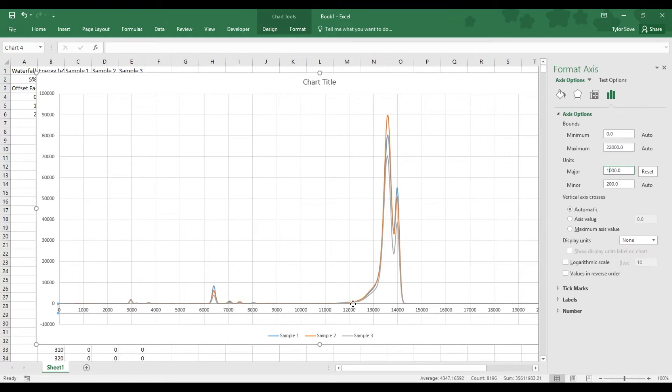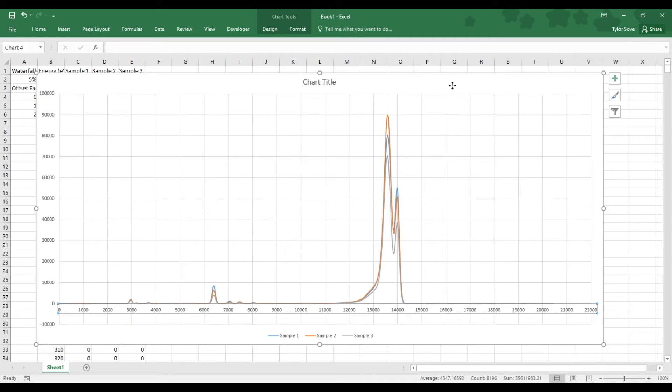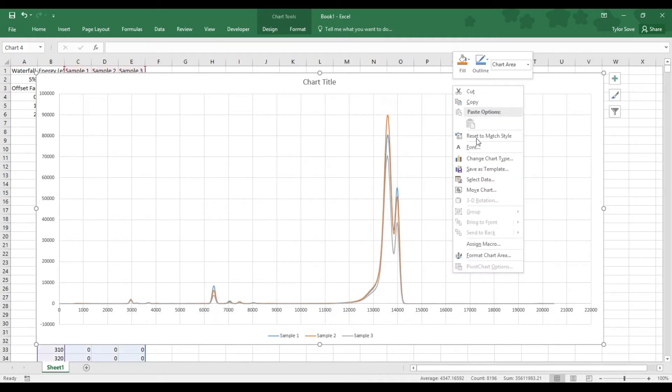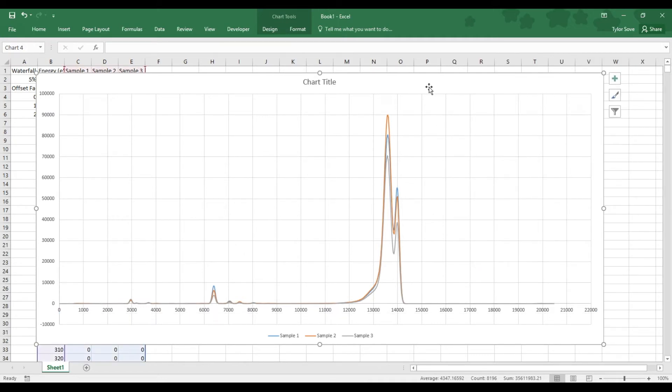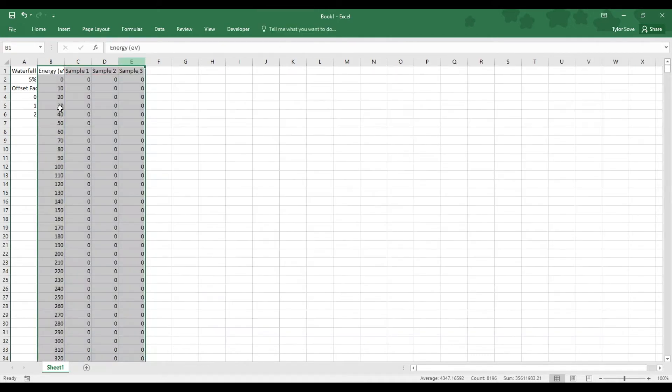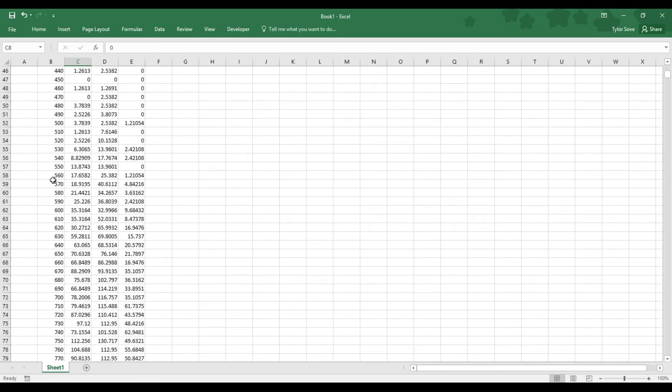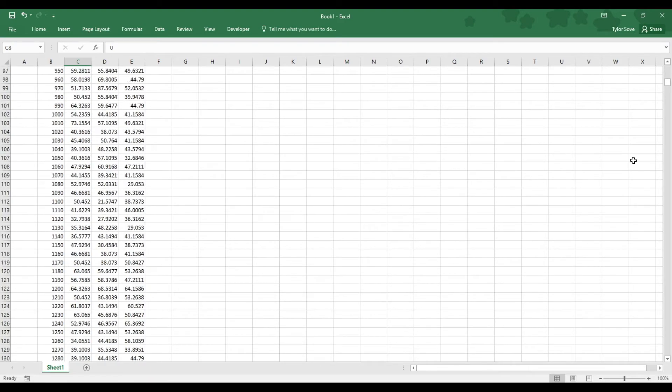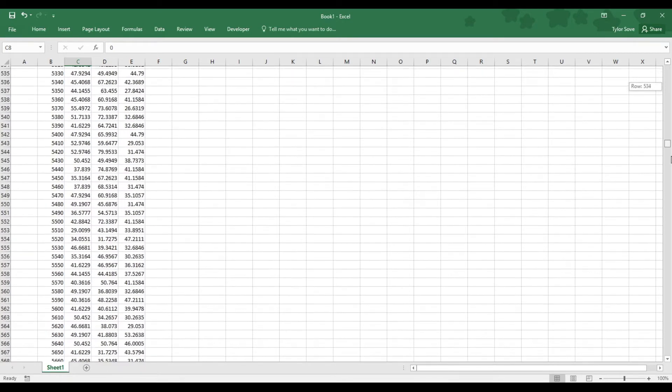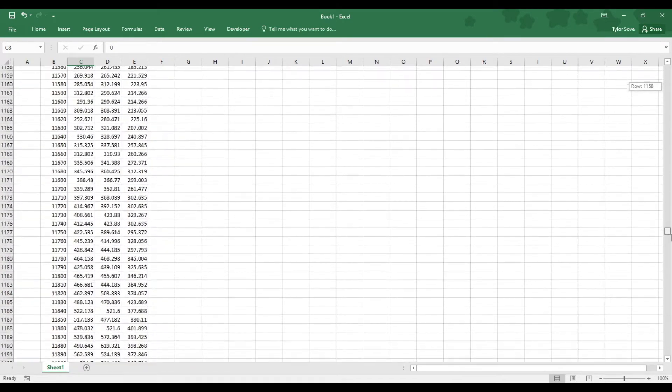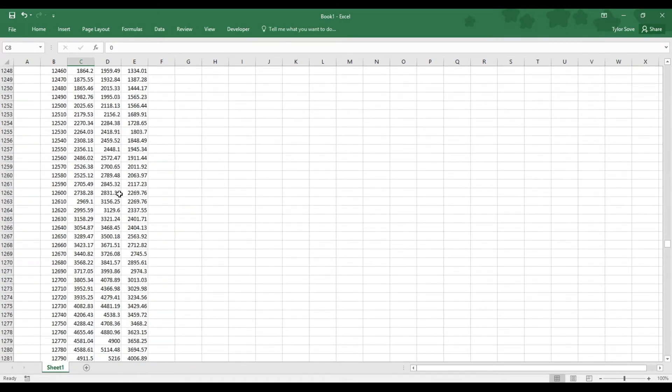I want to find the row in my Excel sheet that corresponds to an energy of roughly 12,000 EV. To figure out that row, I can close this, I can delete this graph, and I can scroll down the energy column until I reach 12,000. It's going to be a little while, so I'll speed it up, there we go.